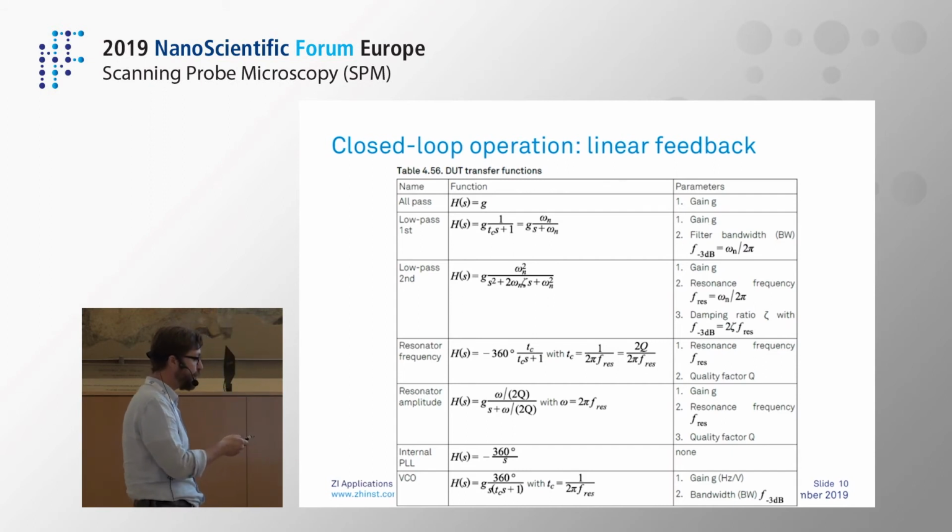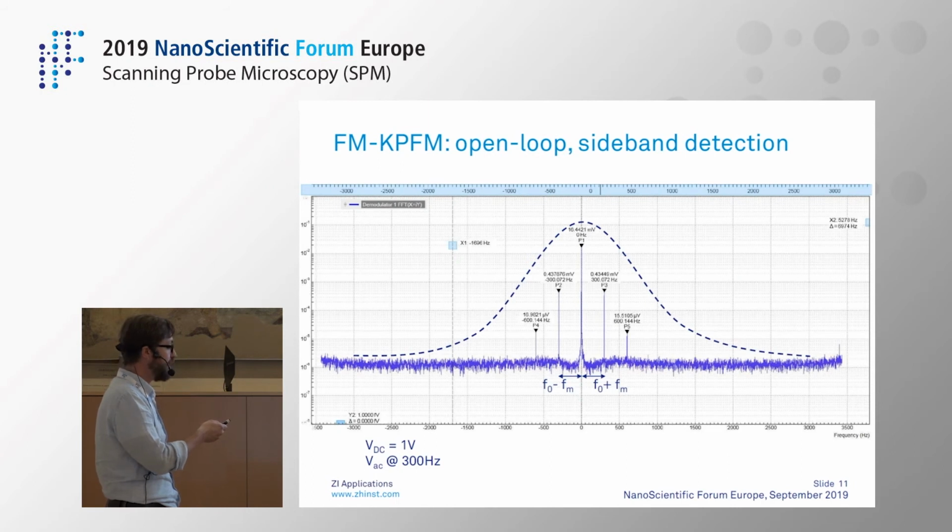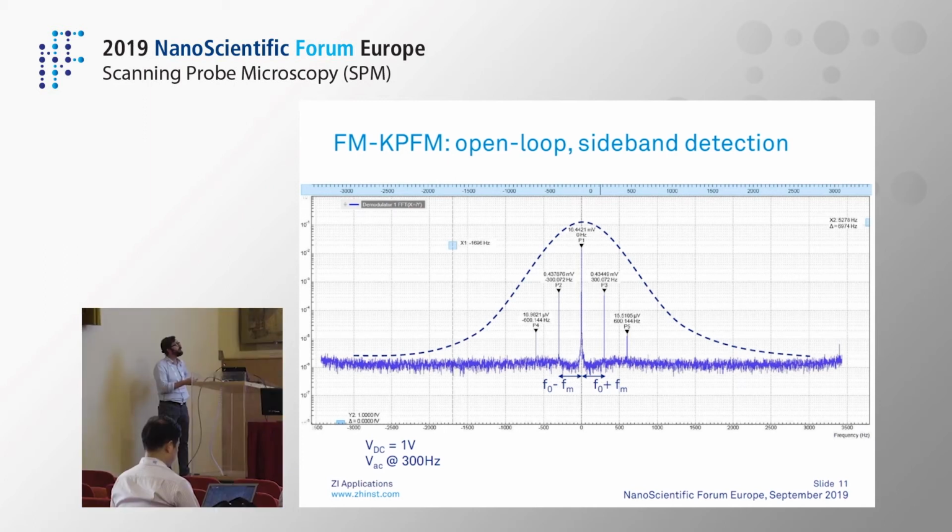Yeah. So once you define a nice resonance, you can start to make a little bit more complex experiment, like adding some additional modulation. That's a very typical one for Kelvin probe. Basically you mechanically drive the carrier, the frequency at which your resonance is locked.